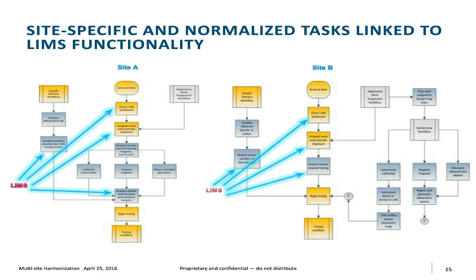If we do things like in the LIMS world, trapping erroneous entry ranges, as I said in the example of a pH of 17, we can trap that the instant an analyst tries to enter that. So if an analyst mistypes 17 when they meant 1.7 for a pH, it's echoed right back to them immediately, and they make that correction on the spot. In a current state environment or an Excel spreadsheet or something like that, that entry could have gone through there. What happens? A supervisor catches it, sends it back for correction and initialing and change and so forth, and it adds to the overall productivity killers.